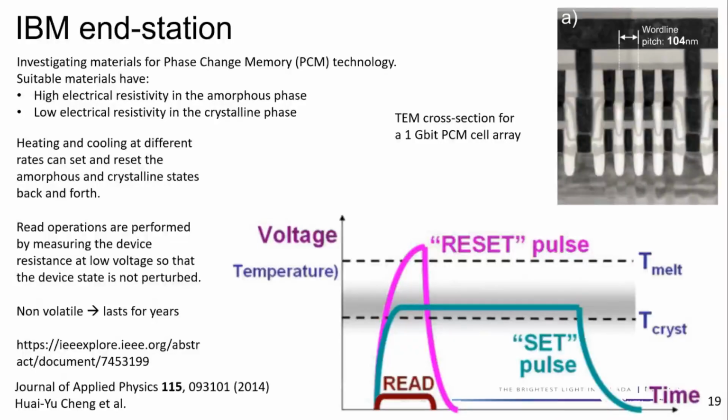So one last example that I brought for this station is an application for phase memory materials research. And a phase memory material is a material that's going to change something, in this case, the resistance, when it goes from one phase to the other. And germanium telluride is one of those materials. When it's in the amorphous phase, it has a very high resistance. And when it's in the crystalline phase, it has a very low resistance. So you can use that for a non-volatile memory chip.